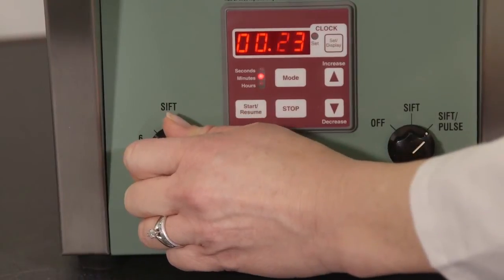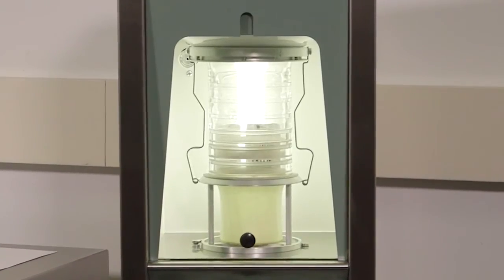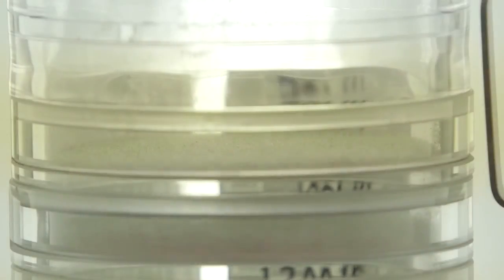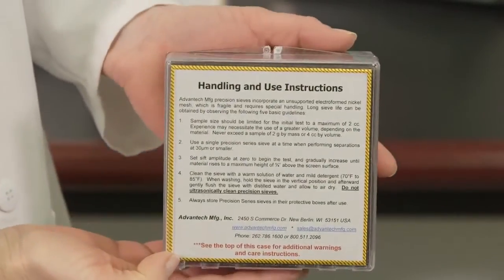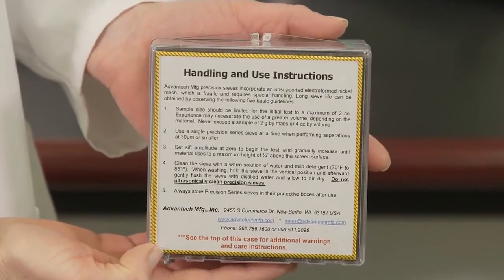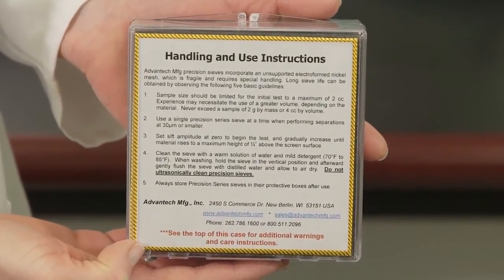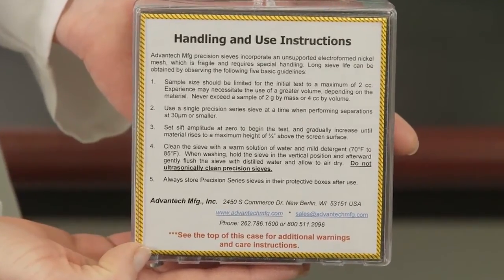Slowly increase the amplitude while observing your sample through the transparent sieve frames. The optimum amplitude has been reached when the largest particles are rolling on the sieve surface and no particles are arcing higher than half the height of the sieve frame. Beware as settings for precision line sieves differ. Refer to the instructions on the jewel case of your precision sieve before proceeding with your test.